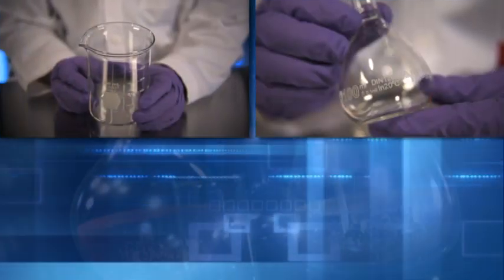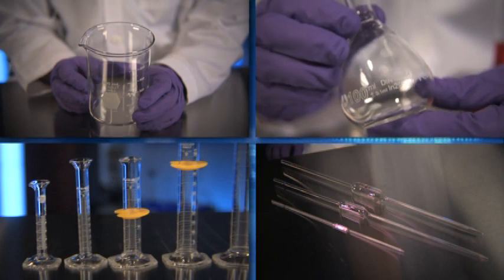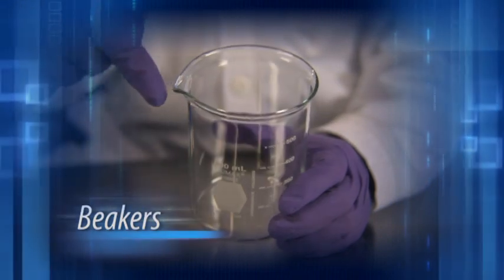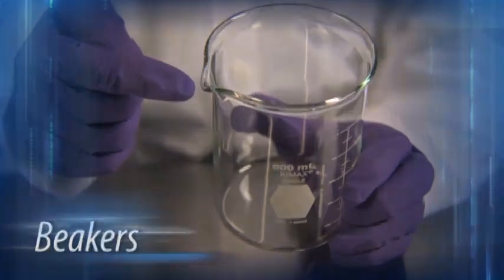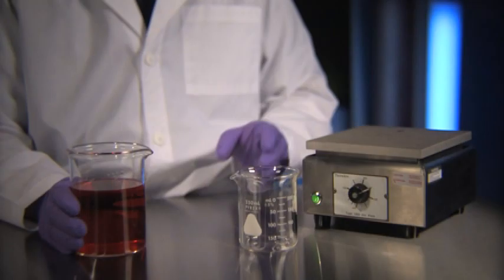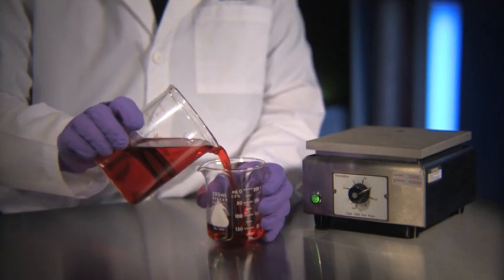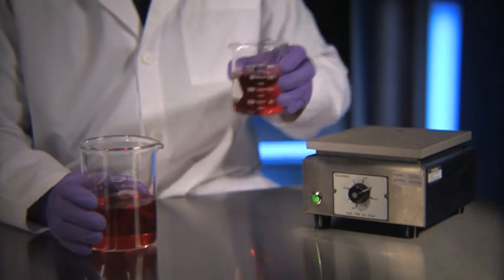Liquid ingredients are measured using beakers, volumetric flasks, graduated cylinders, and pipettes. Now let's review the function of each and how to read the measurement accurately. Beakers are wide-mouth glass cylinders with flat bottoms and a pouring spout. They typically range in size from 40 milliliters to 1,000 milliliters, or a liter. Beakers are useful in a laboratory setting because they can hold and transfer large amounts of liquid. They're durable and able to withstand high temperatures from an open flame or a hot plate.